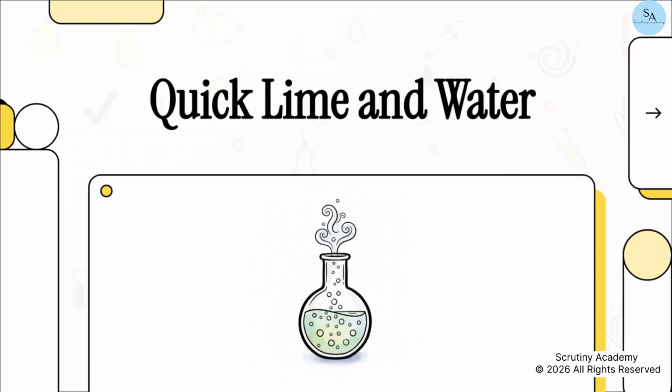Let's see what happens when quicklime reacts with water. This is a super common experiment, you know? And for a very good reason. It's simple, but it teaches us so much about chemistry. So today, we are going to break down this fiery reaction step by step so you understand everything perfectly.